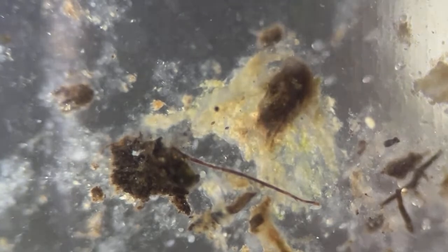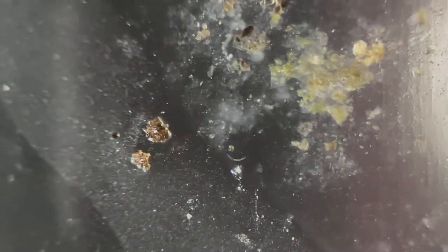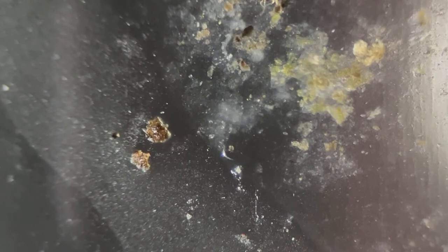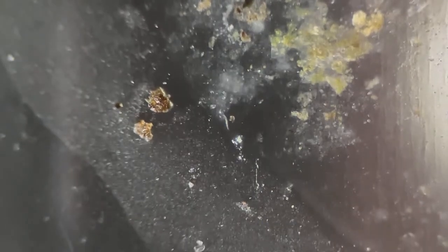So soon I'll develop this further. This worm is glistening.